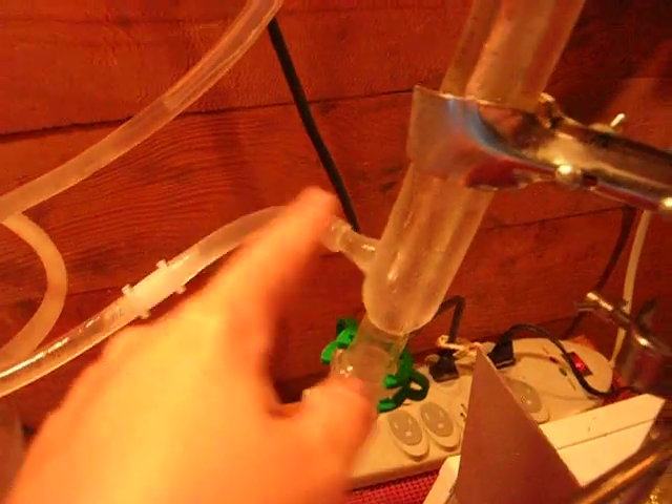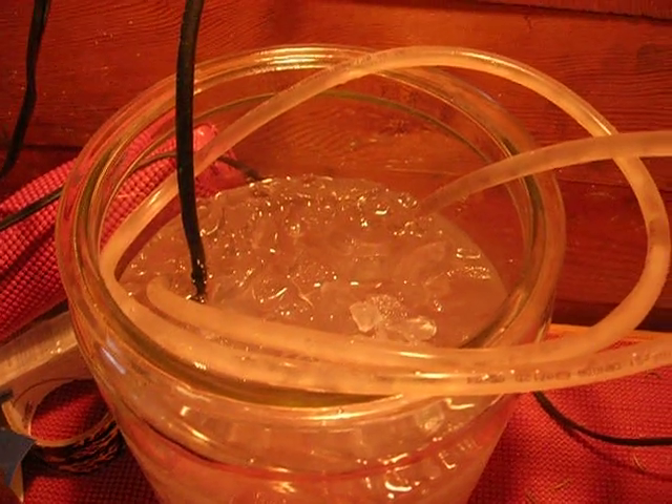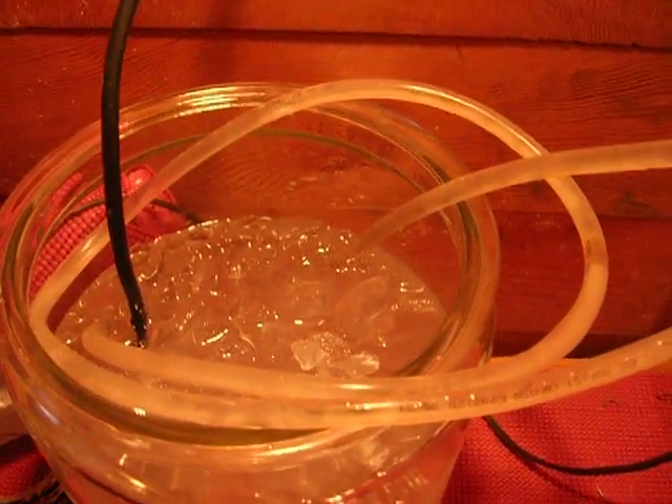It flows in the bottom and out the top. Basically, it draws a lot of heat off, which is why you fill that full of ice. You get all these little drippy bits running down the middle that you can see.